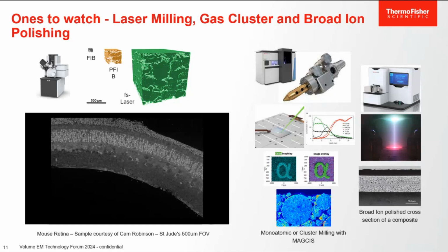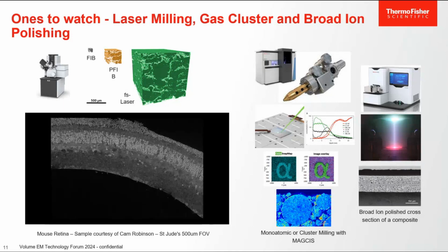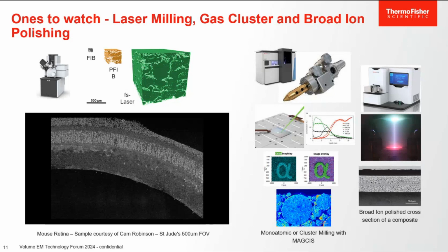The cut face quality is obviously a little bit less than you would expect with ions or even with a knife, but of course it allows you to go through very large volumes very quickly. So this is obviously interesting for people wanting to do whole millimeter or 2 millimeter studies at, say, 100 nanometer resolution. Something like that would be appropriate.